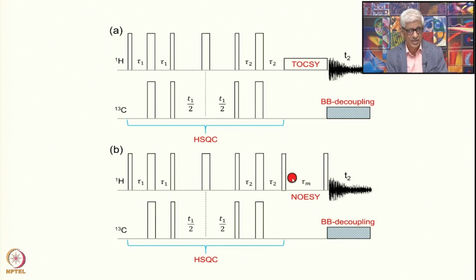Okay, or if there is a chemical exchange happening, that also can be happening here. So whichever process is happening, you will see correlations for those particular protons. Therefore this has a structural input. So while this is useful for identifying the spin systems, the assignments, this has the structural input. It also has input from the point of view of assignments, because the near neighbor interactions will provide you the assignments, and it will also provide you the structural information, depending upon the molecule you have.